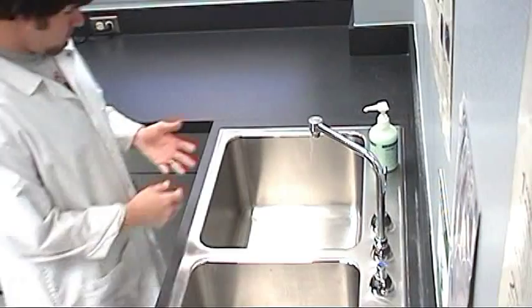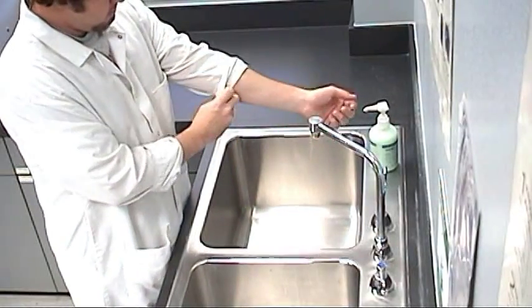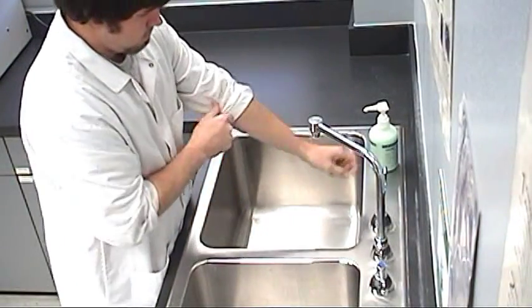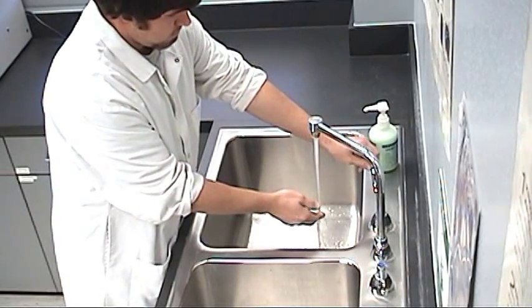Routine handwashing starts with removing all jewelry from your hands and wrists. Roll up the sleeves of your lab coat, turn on the faucet, and adjust the water to a temperature that is warm but comfortable.